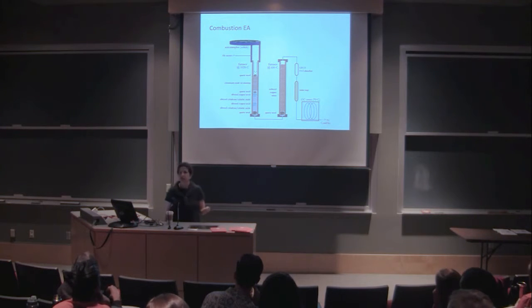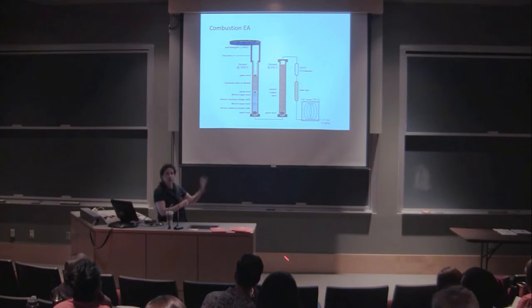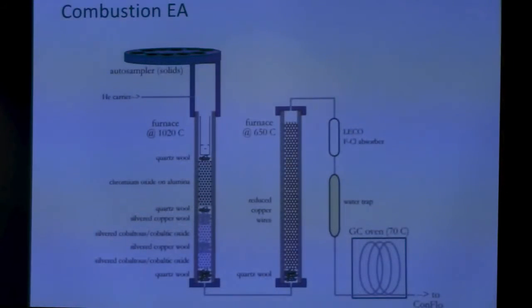They're really doing the hard work of isotope measurements in so many ways. So the idea is you drop your sample into an oxidative environment, and that converts organic material to CO2, and nitrogen to NOx, and it can also have sulfur gases released. And then there's subsequent reactions that can take place. In this particular example, it's reduced copper, which converts NOx back to N2. And then you've got this mixture of gases that you want to analyze, and they're all on top of each other, so that's no good. So we separate them with a little GC system at the tail end of this, that separates the CO2 from the N2 from the sulfur gases.